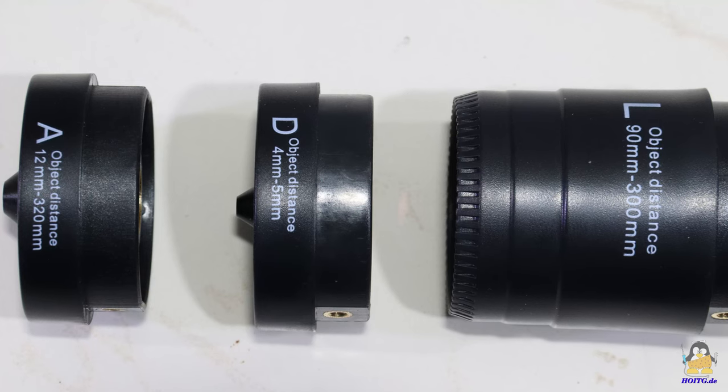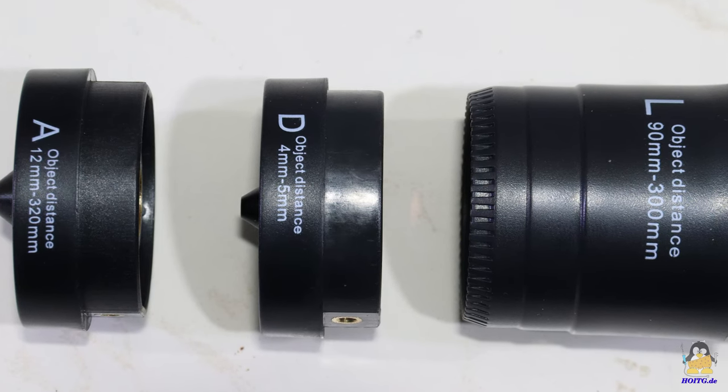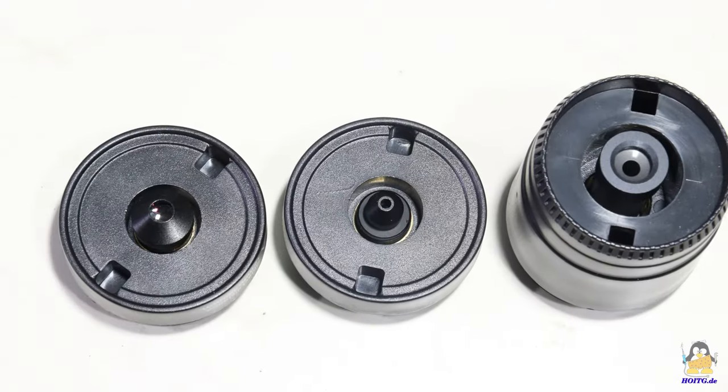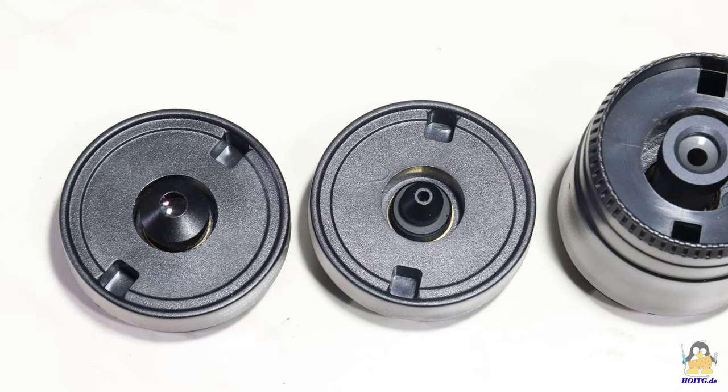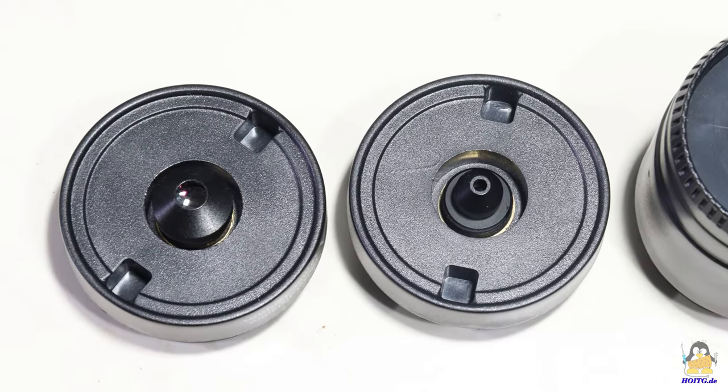The tubes of the lenses are made of plastic, but the manufacturing precision is sufficient to get well focused images. The lenses are well protected, hidden inside the tubes.